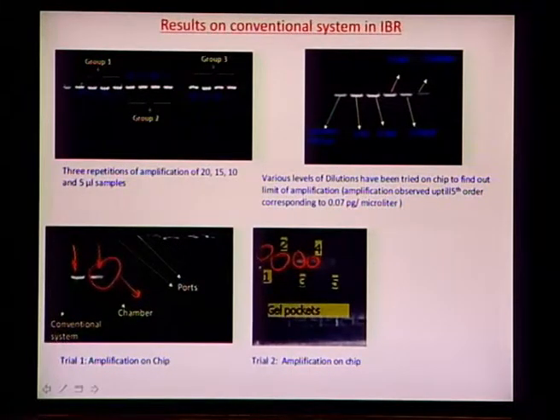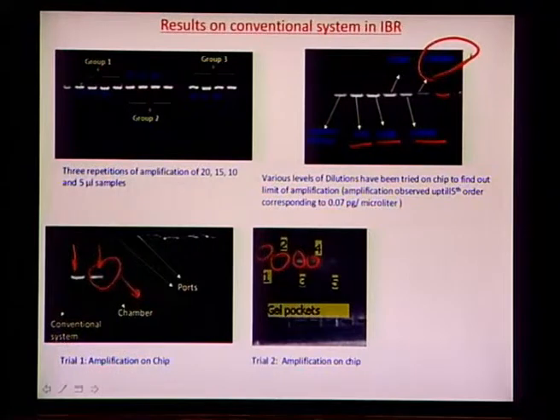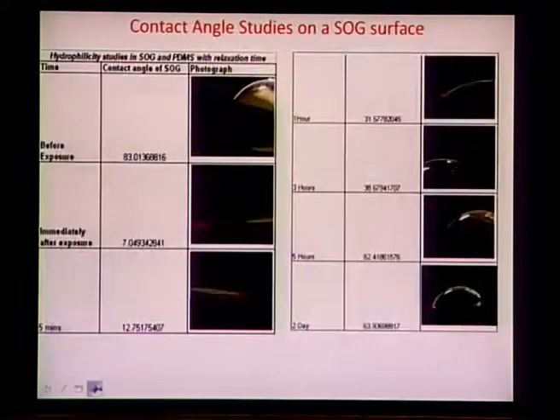What is also important to mention is that if you have a PCR initial template, and then dilute the template 1/10, 1/100th and 1/1,000th, you still get good signals up to 1/1,000th here, and this right here is probably 1 in 100,000 dilution, beyond which the signal would fall down. So, if you can actually go to the 5th order, this would correspond to 0.07 picograms per microliter, which is a pretty low level of amplification that this chip could take.